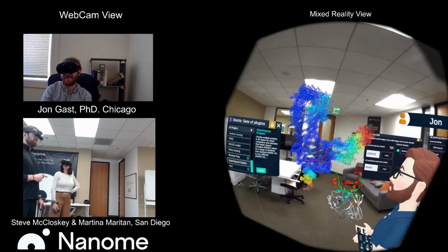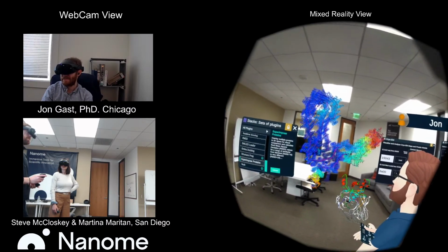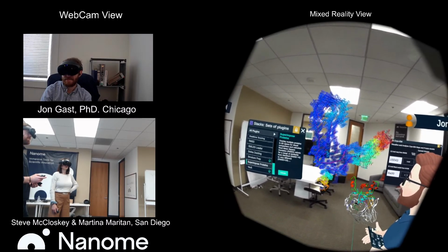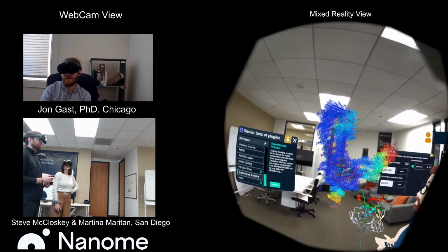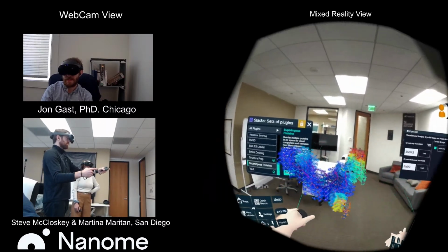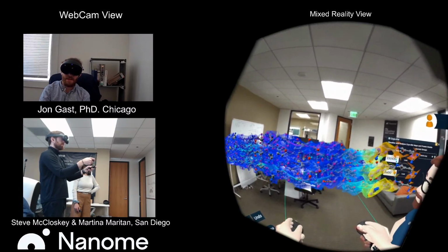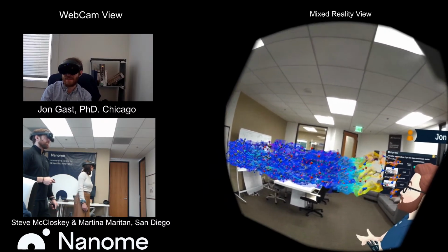So on that note, you might have already answered this, but I'll just ask it just in case. Coming from an audience member here, how accurate is the alignment between the EMDB map and the corresponding RCSB model? So they're about as good as you possibly could get, just because of how those two databases work together. If you go into RCSB, the data is directly from EMDB, and then it's just submitted through there. So it's as accurate as the submitters can possibly make it.